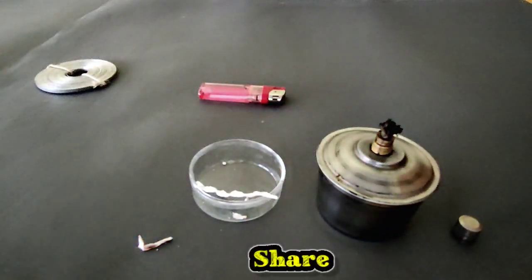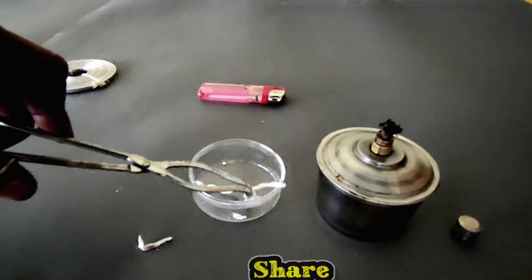You see that the white powder falls down in the petri dish.